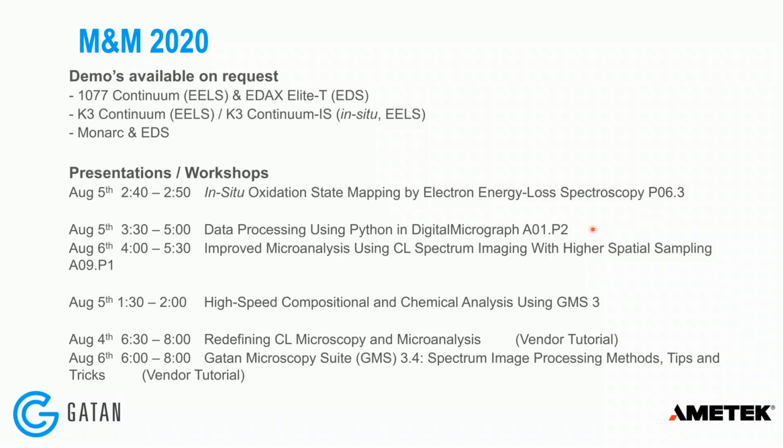I mean, they are more sensitive than the indirect detector, but it's more radiation hard than you probably think. You can use it as a regular imaging camera. Particularly with the Continuum, where we have the fast shutter, you can use the detector for diffraction, for CBED, EELS. Obviously, EELS is a high brightness application if you're looking at low loss. So yeah, it's more versatile than you would maybe assume.